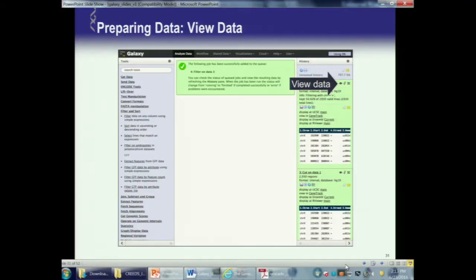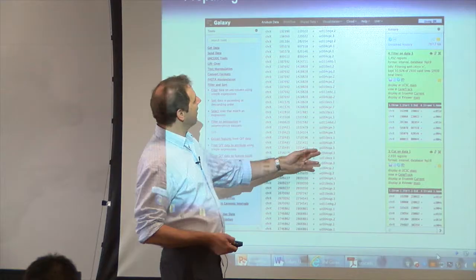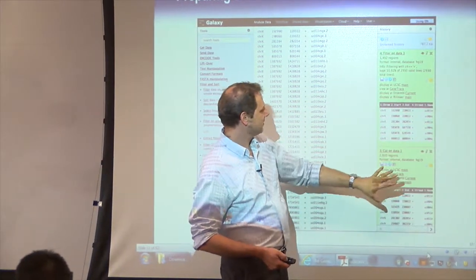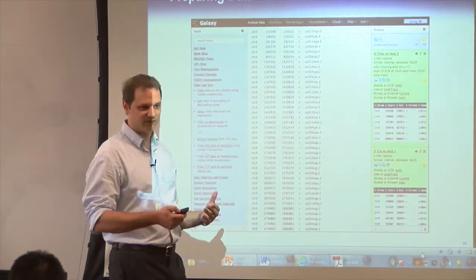And again, once you've got that, it's always a good idea to check that whatever you asked the computer to do, it actually did. Sometimes mistakes get made. Sometimes it will throw an error and it will usually tell you, but sometimes weird things happen too. Again, you just click on the eye, and now if you look at this, you see we have genes, every single one is positive, and as we did this cut earlier where we said we want chromosome, start, stop, strand, and gene ID, that's what we have.